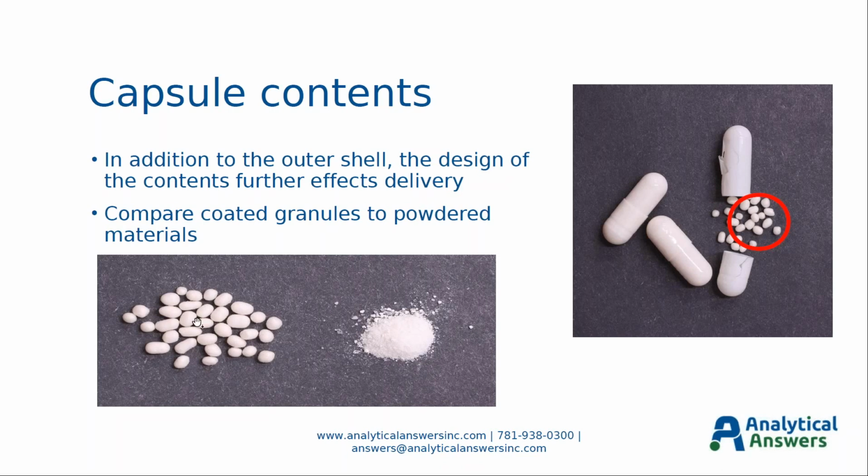Now, for both of these, it's interesting. Again, you can see materials being extracted out of them and redeposited on the surrounding stage.